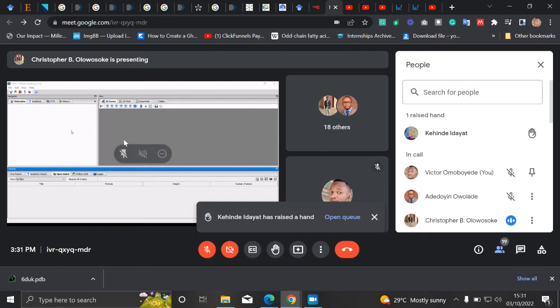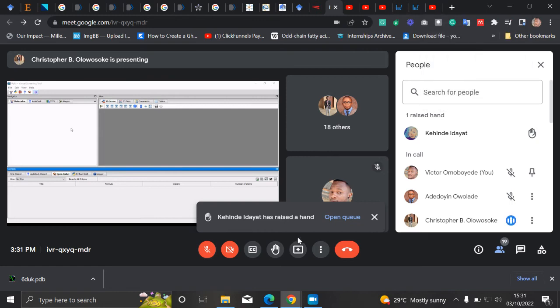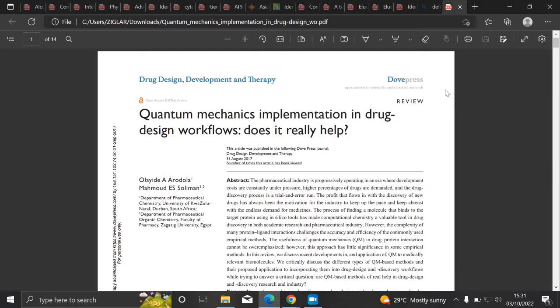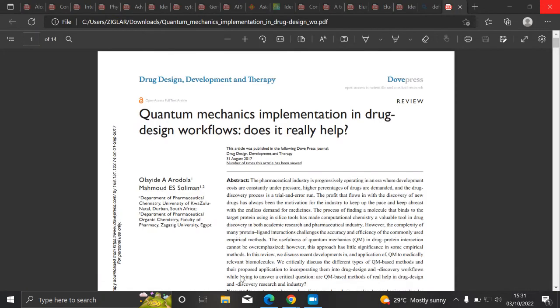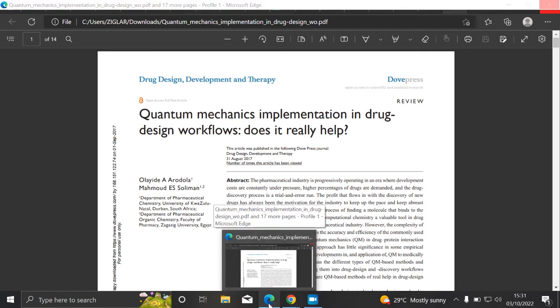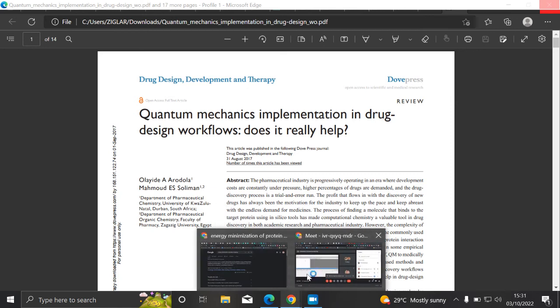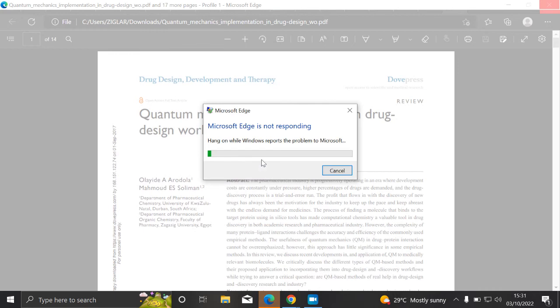The second one is the pre-process, that is the one where I removed the ligand and the water molecules. The third one is the prepare, that is the one where I added the necessary charges, added the hydrogen, and then minimized it as Mr. Victor has done. The fourth one is the native ligand that was co-crystallized with the macromolecule on PDB. I've been able to prepare that. So I'll be using this 7VSI prepared. I click on it and open it.